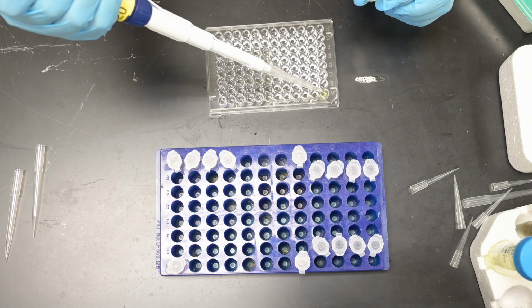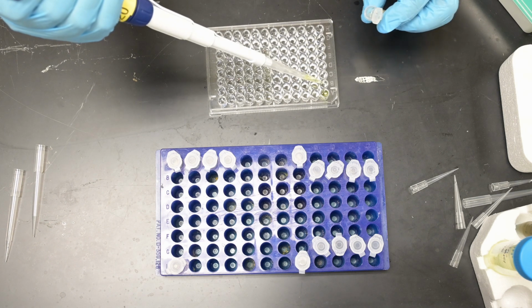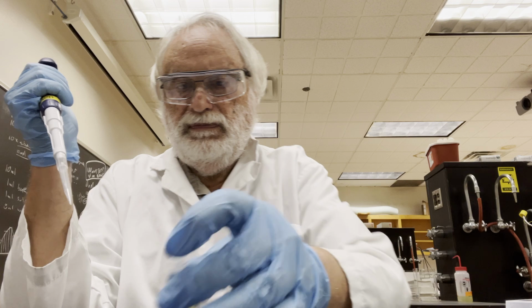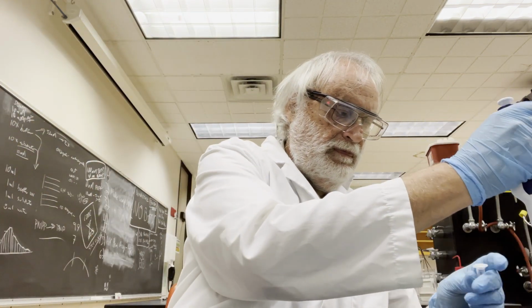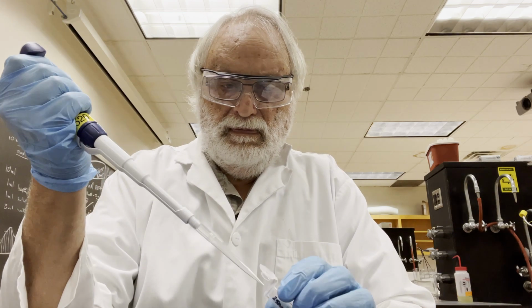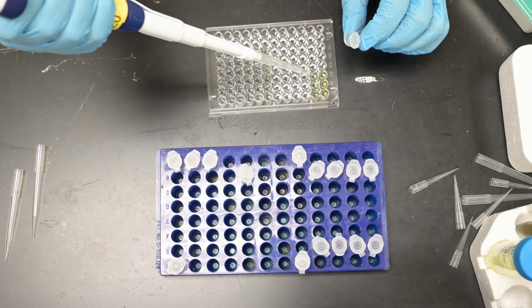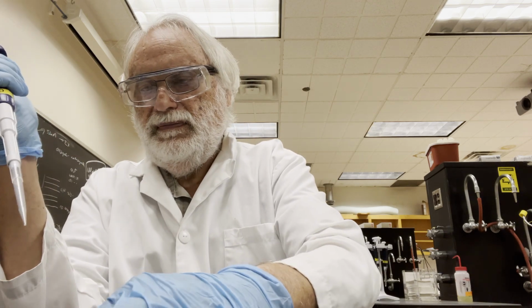So column A. And this is the 20 millimolar here, the 500 micromolar here, in column 1. Change the tip. So here I have the 250 micromolar, sorry.